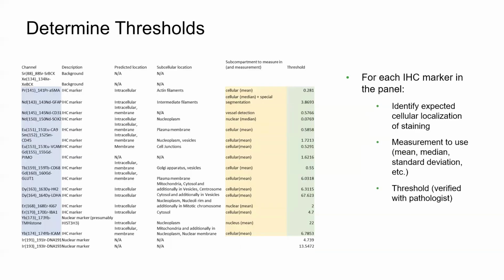Next up, we want to ultimately classify our cells. One key difference about this pipeline compared to existing pipelines, such as the one developed by the Bodenmiller lab or what Codex might develop as part of their Codex MAV platform, is that I actually don't use dimensionality reduction followed by clustering to identify cell populations.